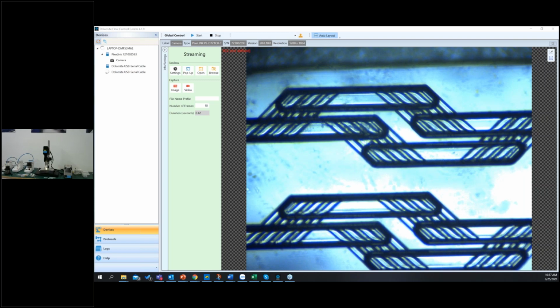With the microfluidic chip, the mixing efficiency number is not clearly determined with experiment, but with the micro mixer chip we can run at a maximum flow rate of maybe around 16 ml per minute.